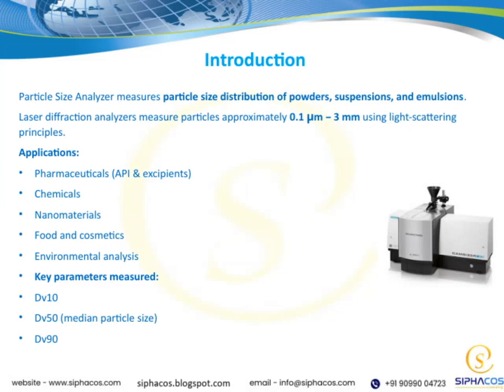Welcome to our introduction to particle size analysis. Today, I want to talk about how a particle size analyzer helps us measure the size distribution of various materials like powders, suspensions, and emulsions. Specifically, we use laser diffraction analyzers, which are capable of measuring particles ranging from about 0.1 micrometers up to 3 millimeters. The principle behind this is light scattering. By analyzing how light is scattered by particles, we can determine their size accurately.